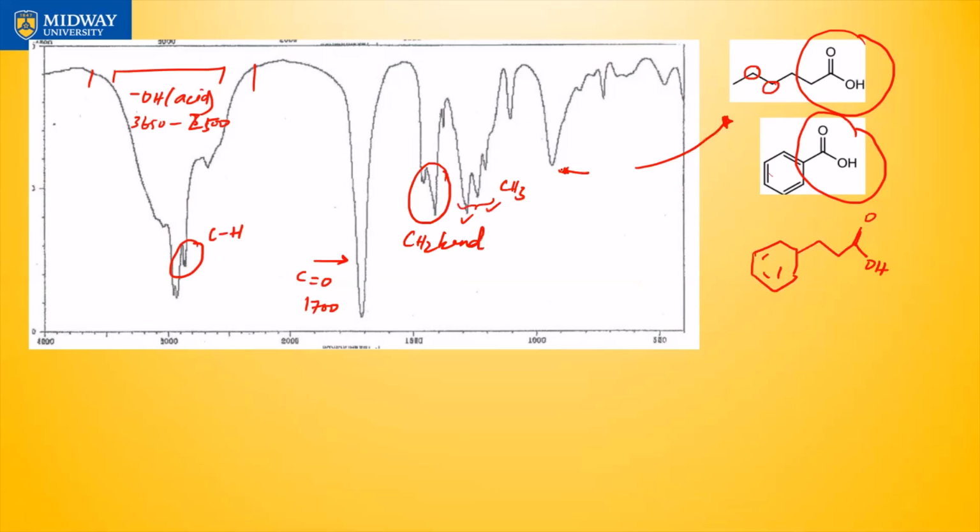Based on the table that we have, I can't nail it down. That's hard. That's a good one. That's really, really hard. I don't think there is enough information here to identify what this peak could be, at least based on the table of information. But we have enough evidence to suggest this is not the case. This is the case.